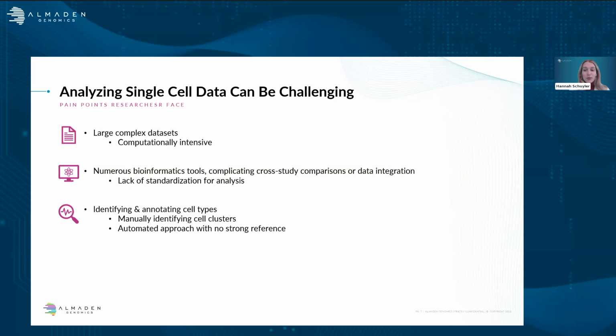There's also a lack of standardization for data analysis as it relates to single cell. Over the years, we've seen so many different platforms, open source tools, and technologies that have been deployed to process single cell data, which of course complicates any sort of cross-study comparisons, data integration, or standardization as you're looking to process these different types of data sets.